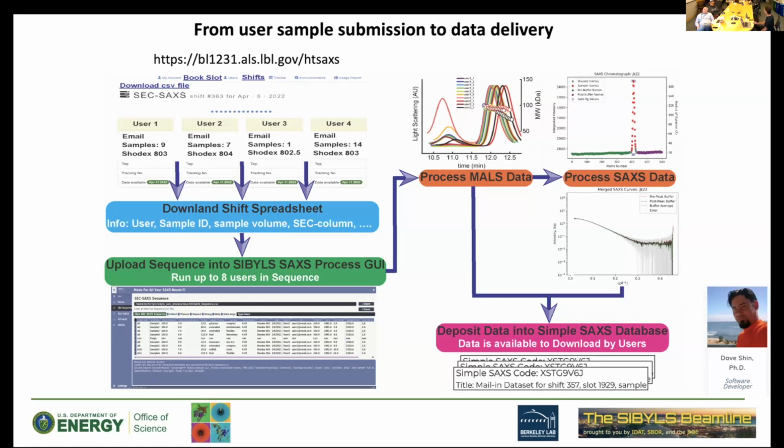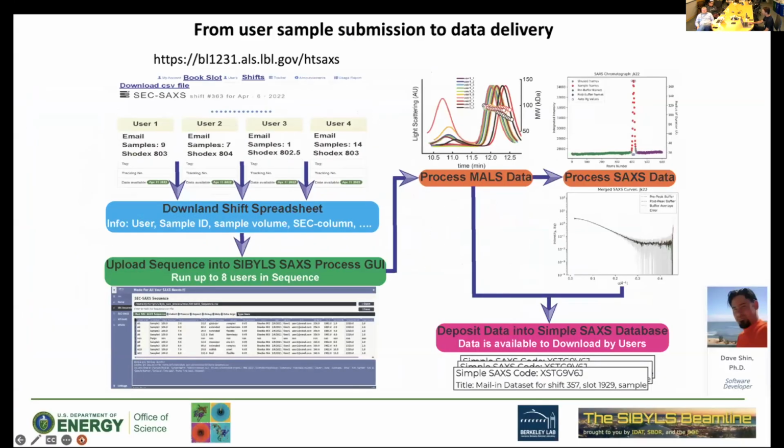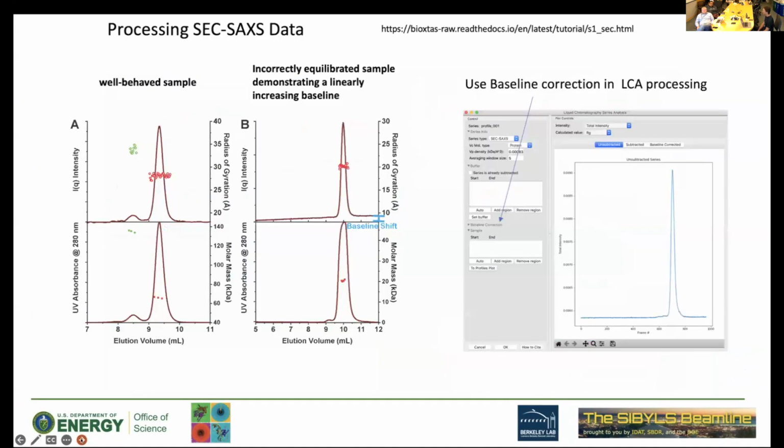Everything's already there. You don't need to add anything. You can just add metadata if you're interested in adding a little more detail about what it is, so that the reviewers can grab it and analyze it by themselves. So that's why I'm showing this slide. Everything is ready for you, and I would like the users to use this capability.